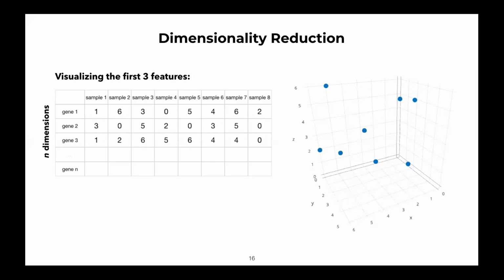But in our data set, we don't have 3 genes. If you remember, I showed you the zero expression file, which had like 96,000 genes, and then I showed you the file without the zero expression, and we still saw more than 3,000 genes. So with 3,000 genes, we want to see what the data looks like.